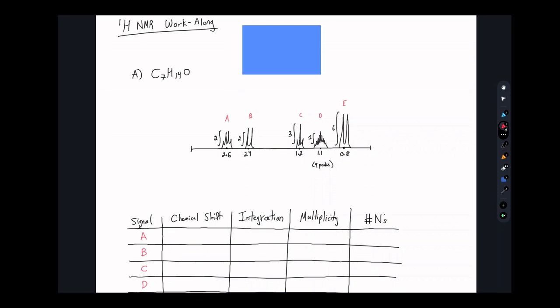Welcome to Lecture 1.8. In this video, I'll be going over 3 NMR spectra that I've prepared, again just hand-drawn spectra with approximate values, that we can use to understand how we can approach NMR spectra. For each one, I've hidden the answer, along with the correct assignments, behind a box, and we'll see if we're correct as we go. Now, feel free to pause the video and try to solve these yourself, or follow along, however you want to do this.